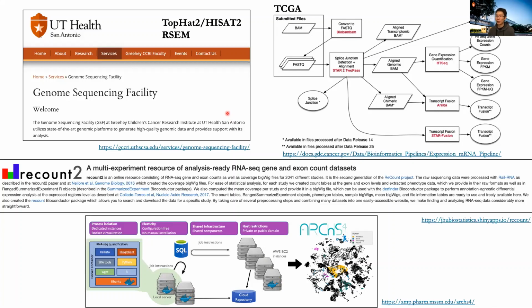So what would be the alignment tools? In our course, as far as I know, we use the TopHat tool and HISAT and also RSEM. Those are alignment-based methods. After alignment, you'll get the chromosome and location to indicate where each of your reads come from.